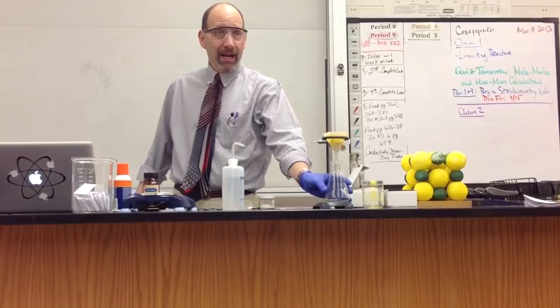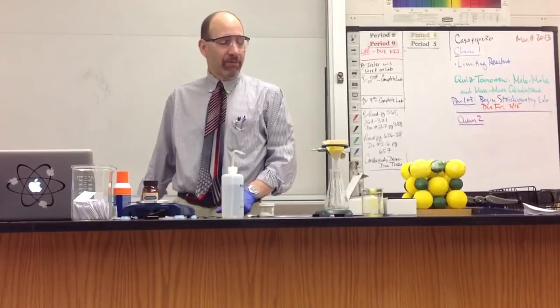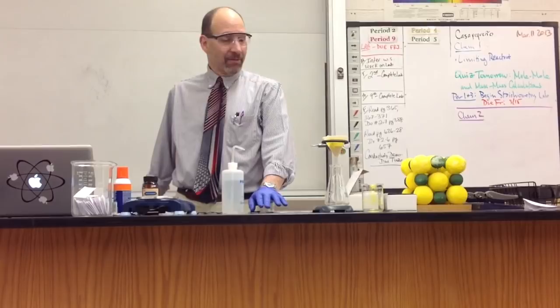We're going to capture all the lead salt, the lead iodide, up at the top here. And then coming through in the bottom, inside this flask is going to be the other product, which is the sodium nitrate. Again, sodium and nitrate, both ions that make soluble product. So the sodium nitrate is soluble. And what we would do if we were going to collect this overnight is we'd take the flask and put it in the oven to dry, evaporate off the water, and we'd be done. All right, questions? All right, so here's what we're going to do now. We're done.